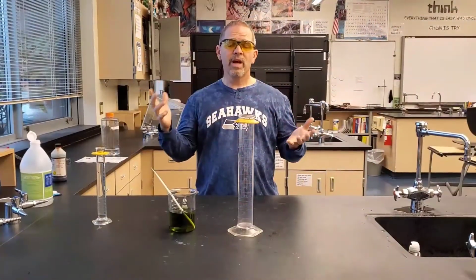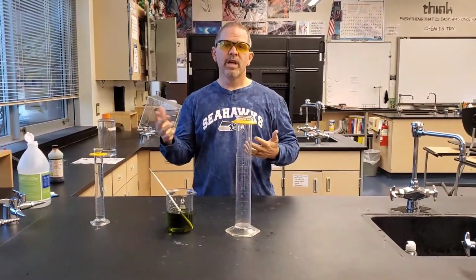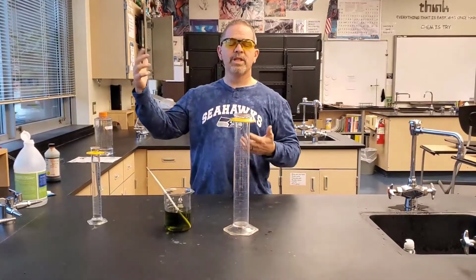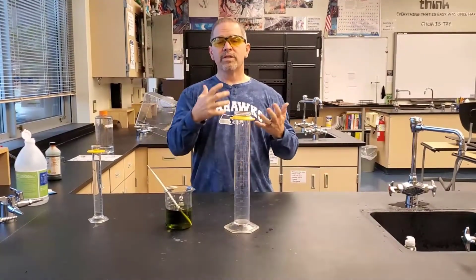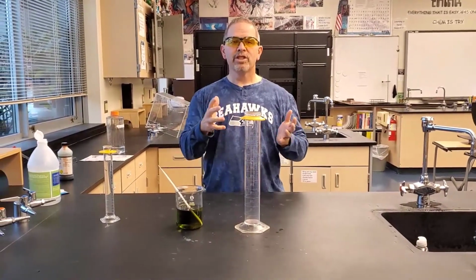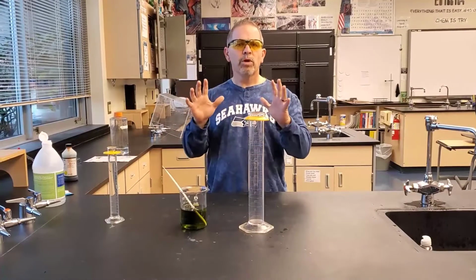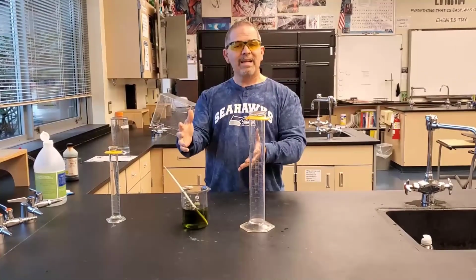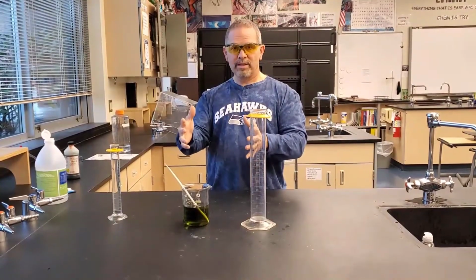Okay, so the third sign of a chemical change is a color change. And you see color changes every so often in real life. For example, in the fall right now, we're seeing leaves change color. If you see metals tarnish or rusting, and even cooking, when things change color from cooking, I mean, there's more to it than that, but that is a sign of a chemical reaction. So we've got some acids and bases today, and we're gonna make some cool color change.